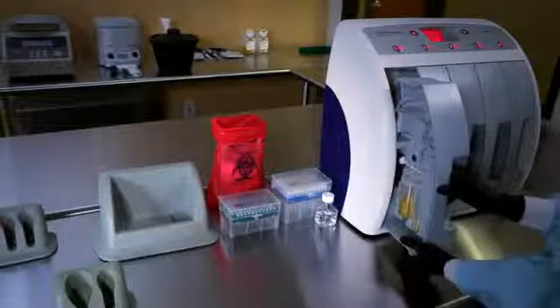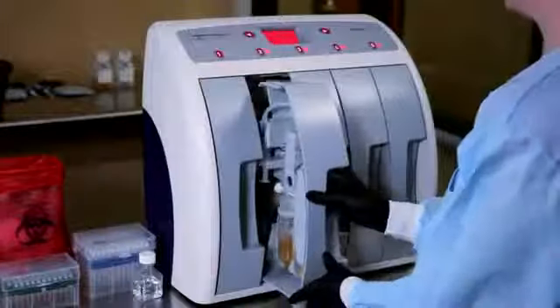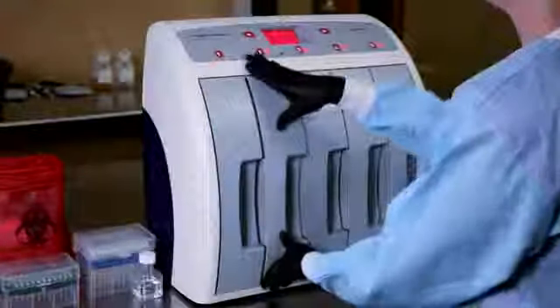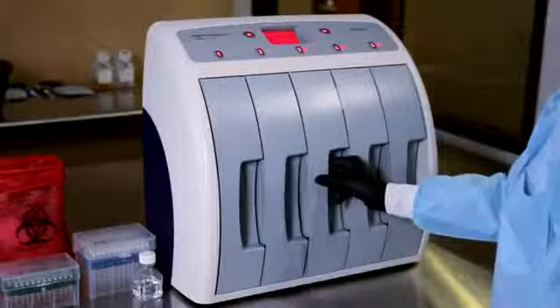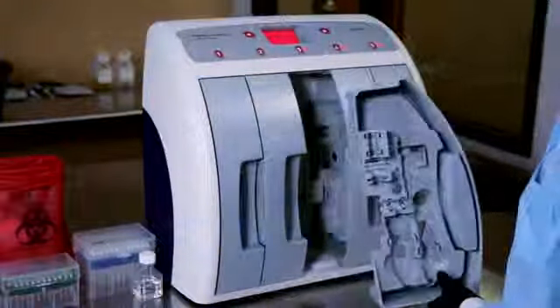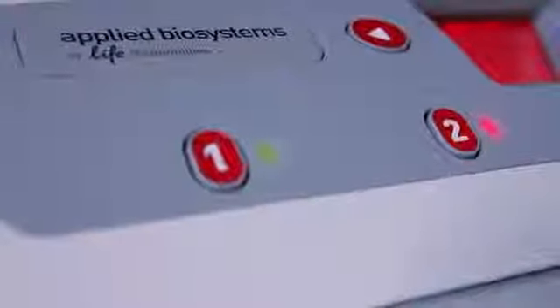Position the cartridge into the guide slots and push the cartridge forward until it clicks. Each of the five cartridges can run independently, and you can run anywhere between one and five at a time. When you're ready to start a run, just push the numbered button directly above the cartridge.